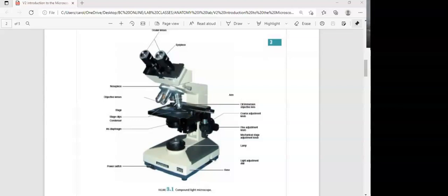I know it's not that clear in here, but they have a line. This one should have a white line. This one on the back should have a red line. This one right here should have a blue line. And this one right here should have a yellow line right there.